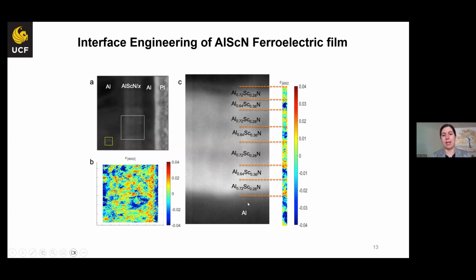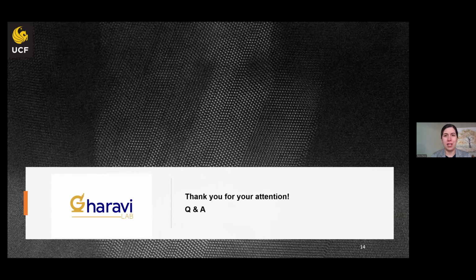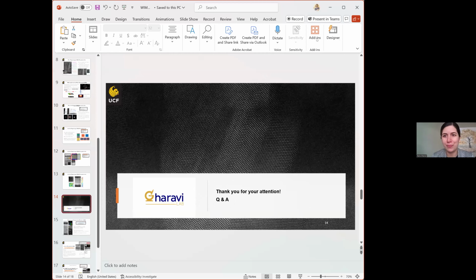And what you can see here are the 4D STEM results. In the TEM image, we cannot see the contrast between layers. However, in the 4D STEM mapping, we can see different colors, yellow, blue, and yellow, blue, which shows us the different strain that we have in our system.